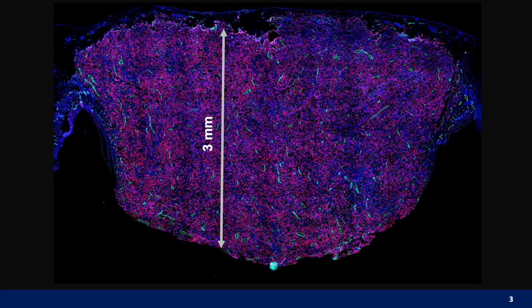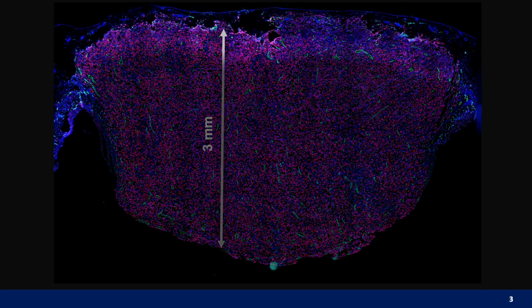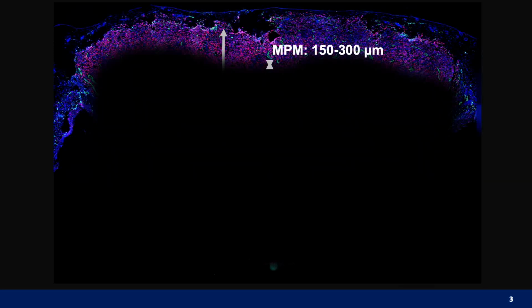Increasing the imaging depth requires higher excitation power, and this can damage the tissue. In densely labeled samples, also two-photon imaging depth is limited by out-of-focus background, so shifting the excitation wavelength from near-infrared to infrared reduces the light absorption and the scattering and can improve the imaging.